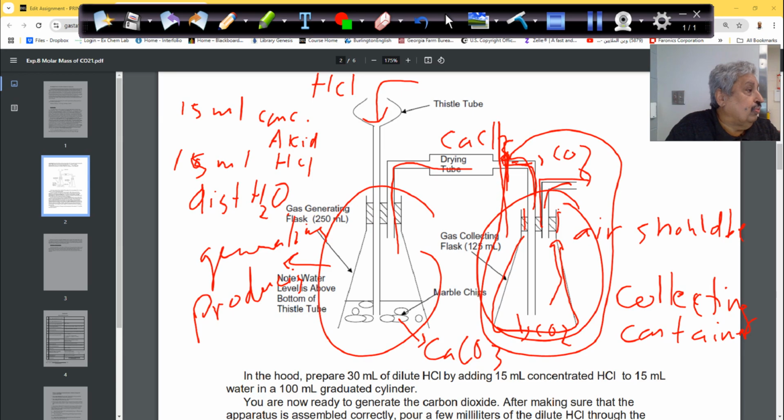Don't touch it with your hands. After the oven, no more hands at any time. To use it, you have to use tissues to carry it from the balance. So weigh it empty after it comes out from the oven, and then when you have the 20 minutes, take it and weigh it with CO2. Then do another 10 minutes and weigh it.